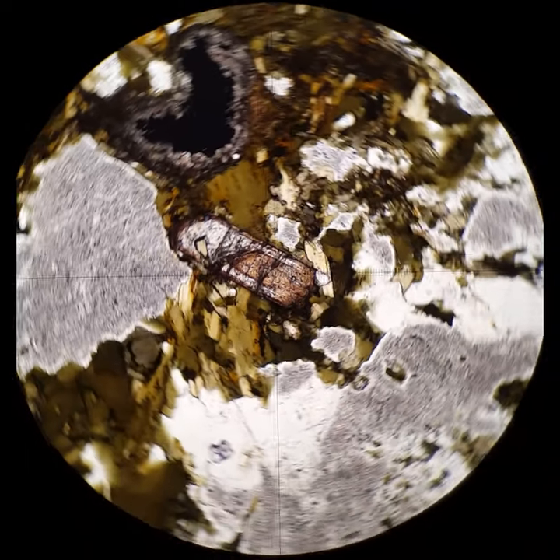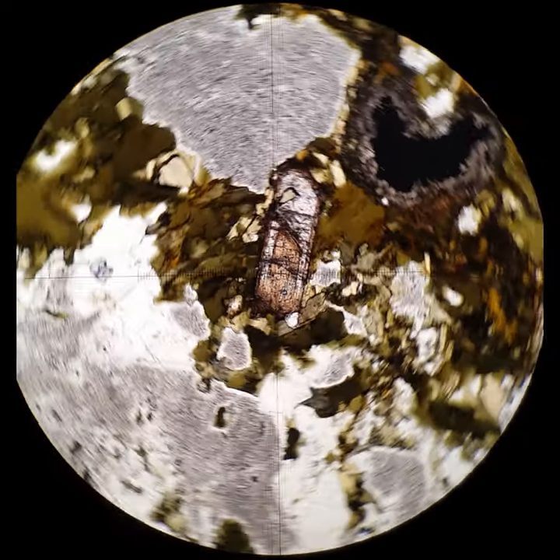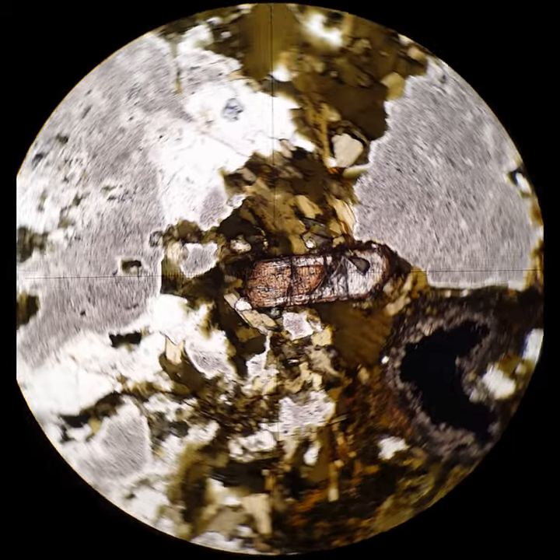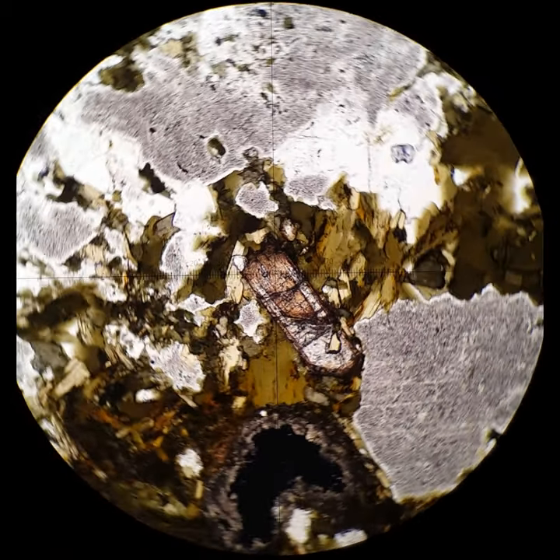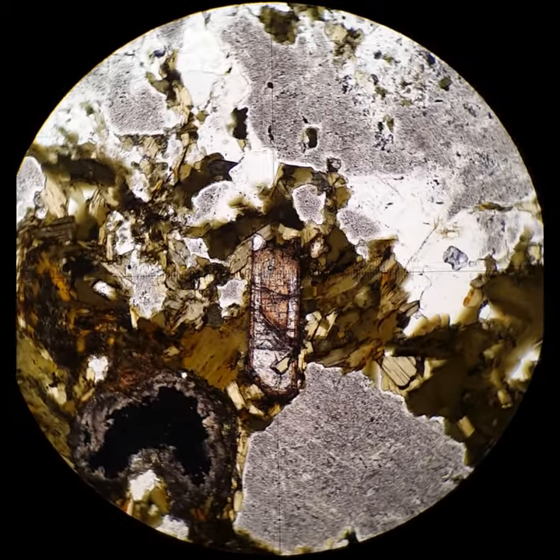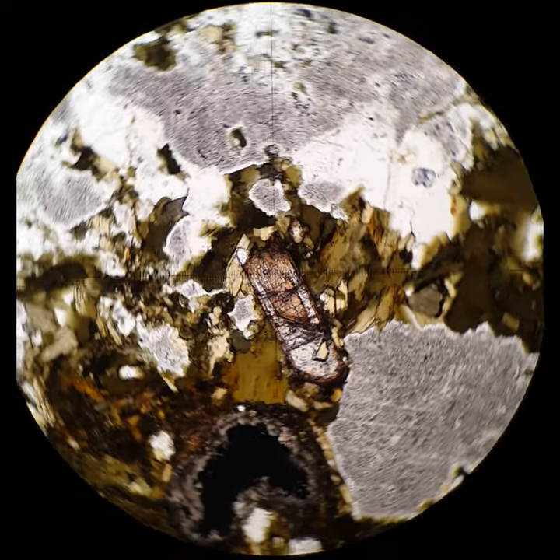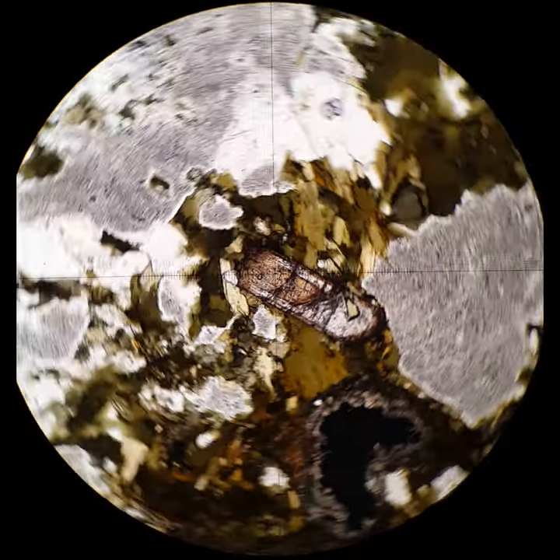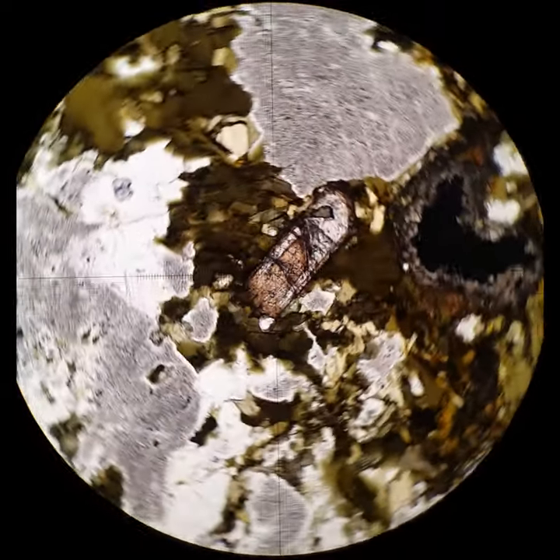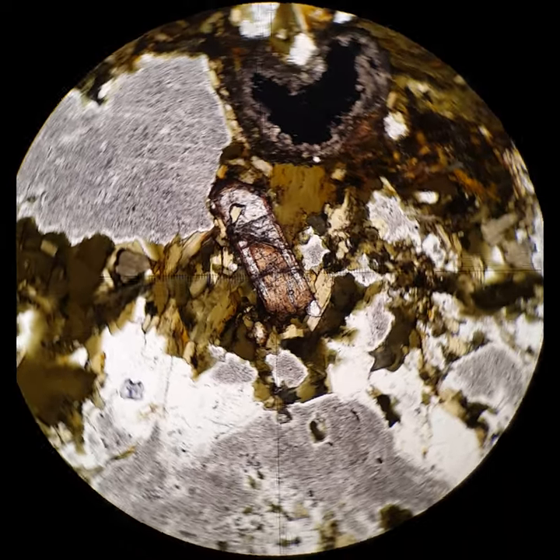This zircon has an inherited core, which is a little more intensely pink than the remainder of the zircon. This helps me identify inherited cores versus metamorphic or igneous rims.